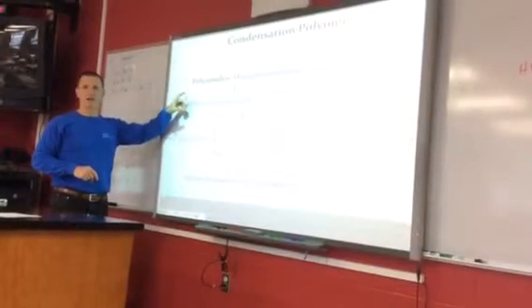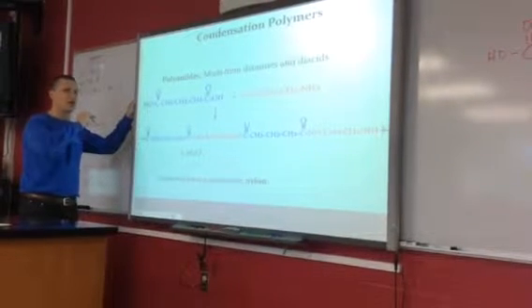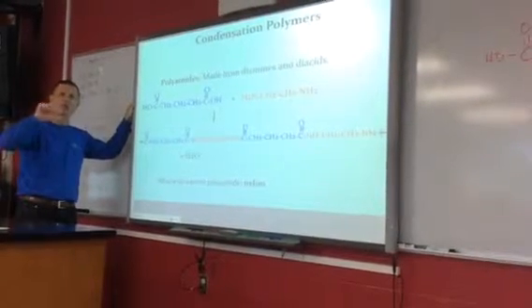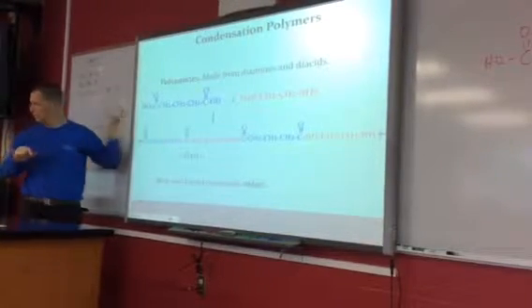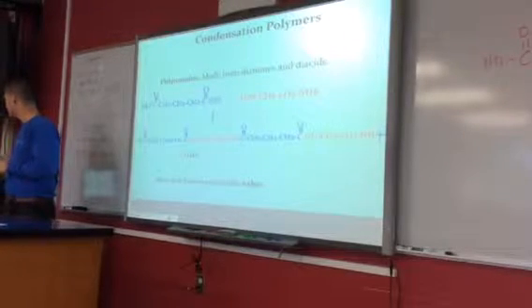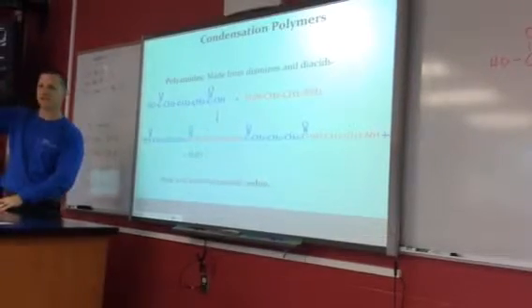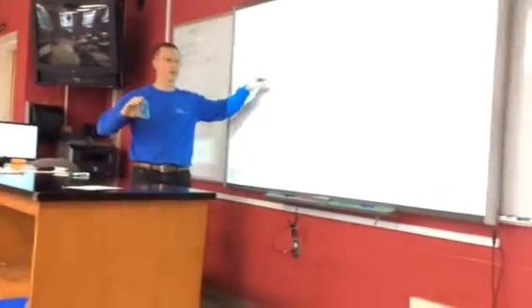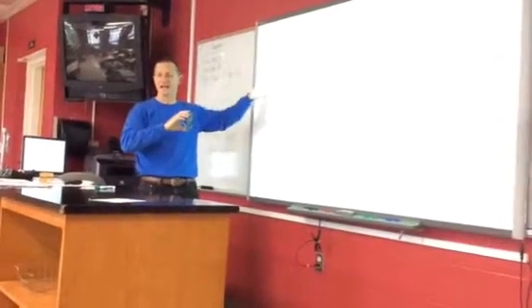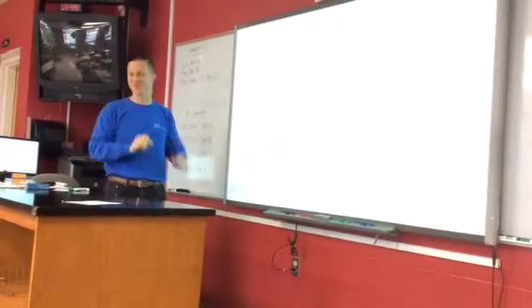This stuff that we use, the reason that we don't just use it straight, we have to dissolve it in cyclohexane. We buy it, I think we buy 100 milliliters at a time. 100 milliliters is not very much. It's just about the volume that will fit into this. In fact, this may be a little bit more than 100 milliliters. It costs more than $100 for this much of this compound. It's not this specific compound, but the diacid compound we're going to use, the acid chloride, is super expensive. So we use just a tiny little bit of it so we can make it last.